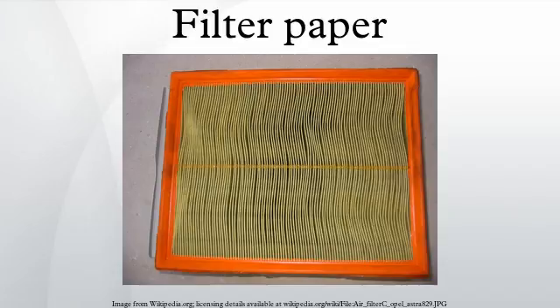Quartz fiber filter. Quartz fiber filter paper is highly chemical resistant, does not absorb NOx and SOx, is unaffected by humidity and easily sterilized. Thus, it is mostly used for air pollution analysis. PTFE filter. PTFE filter has wide operating temperature with high air permeability. The resistance to high temperature makes PTFE filter paper autoclavable. It is often used to filter hot oils, strong solvents and collect airborne particulates.